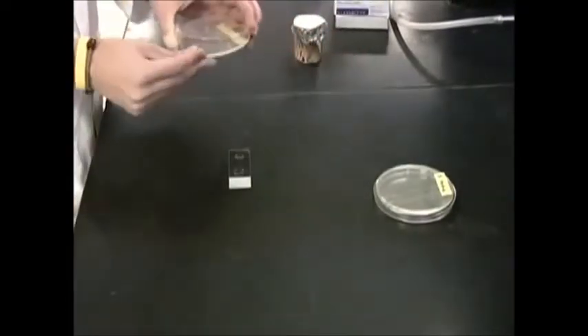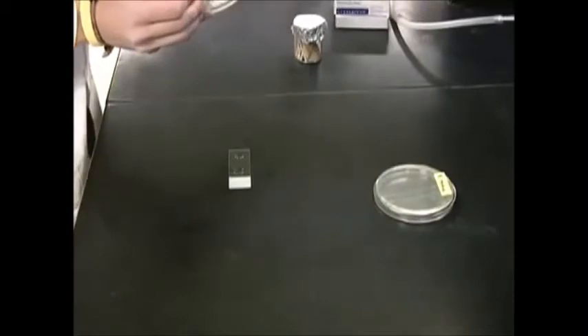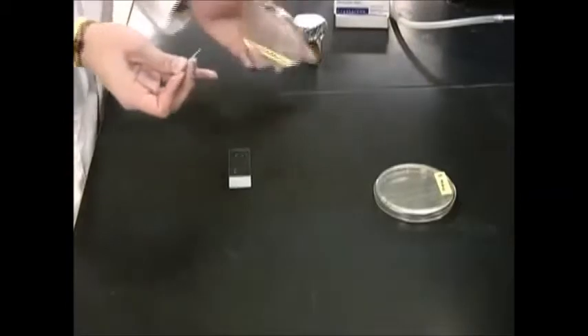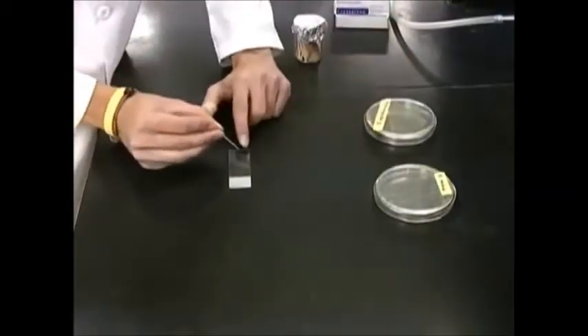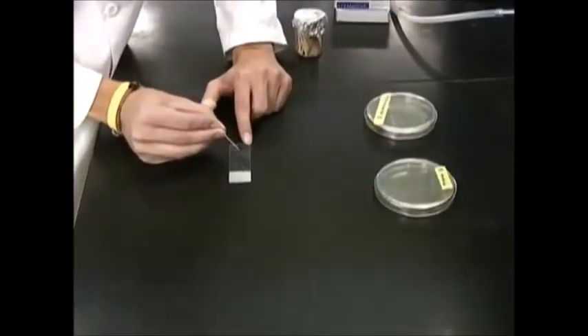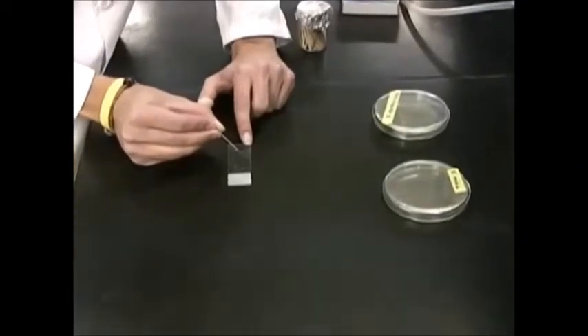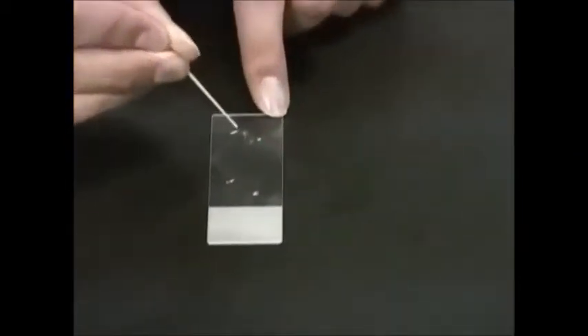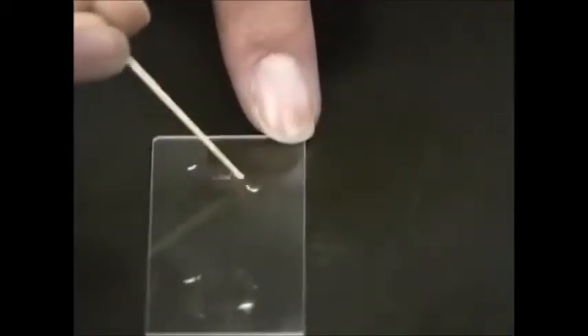Using a sterile wooden stick, pick up a colony of Staphylococcus epidermidis and swirl it in the drop. If bubbles appear, the organism is catalase positive. We will show this up closer in a second to get a better view.